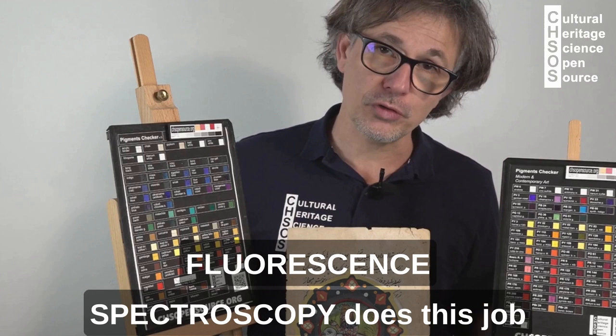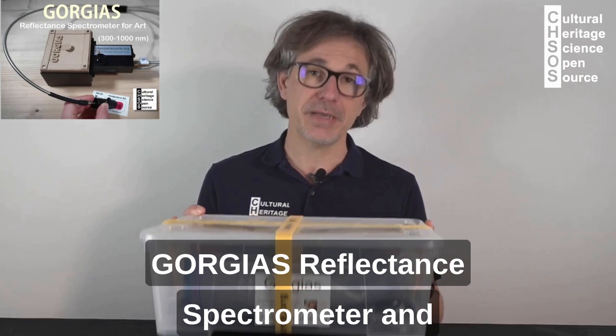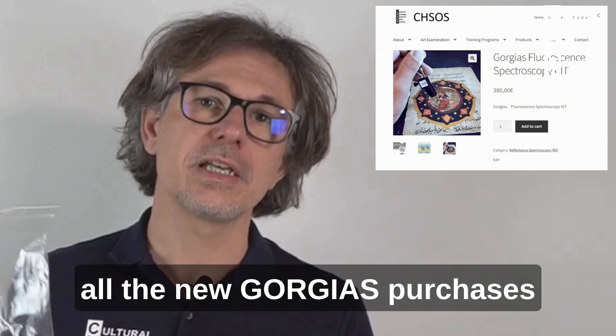Fluorescence spectroscopy does this job. We can do basic fluorescence spectroscopy using our Gorgias reflectance spectrometer and the new fluorescence kit. This kit comes included in all new Gorgias purchases.